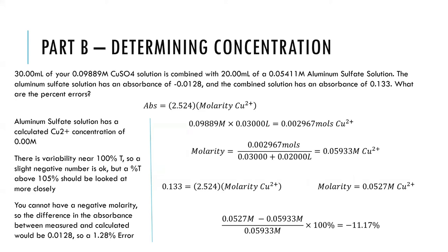When you're measuring the percent transmittance and the absorbance using the spectrophotometer, you're only measuring the concentration of the ion that displays the color. And that ion is the transition metal ion. If you chose the copper 2 sulfate solution, you're looking at the measured concentration of the copper 2+ ion. That's the ion that displays the blue color. The sulfate by itself does not have any sort of color, and the aluminum by itself does not have any sort of color. So when you're measuring the absorbance in the lab, you're measuring the absorbance of that transition metal ion.